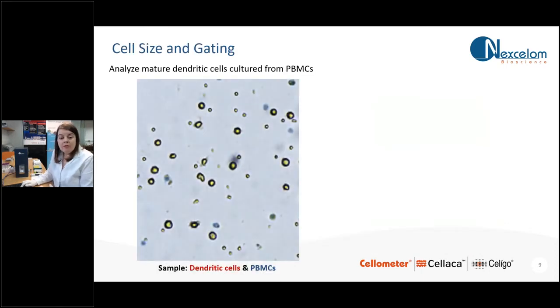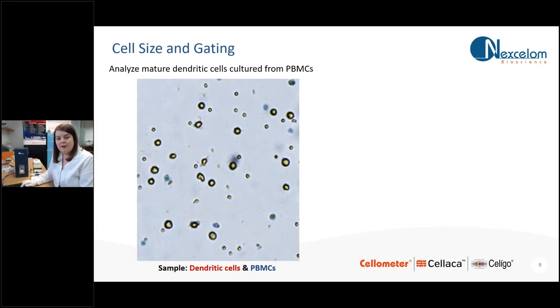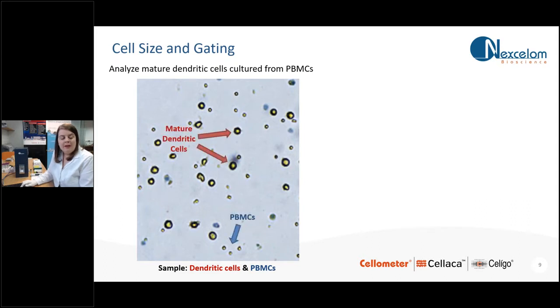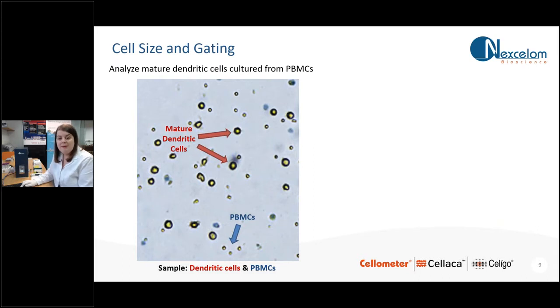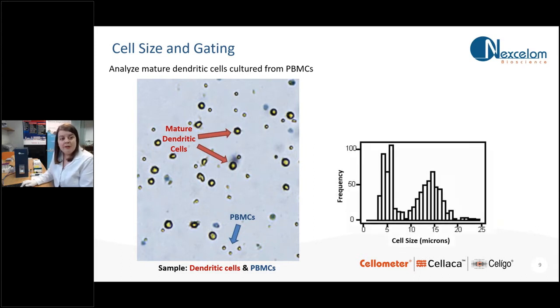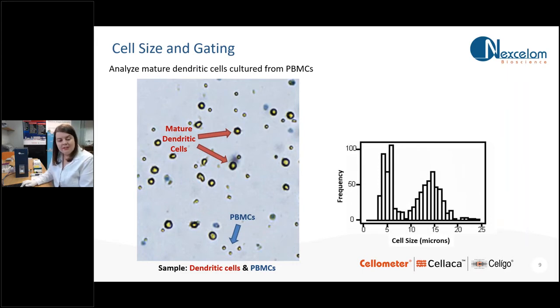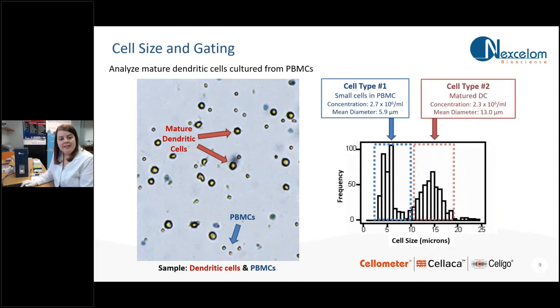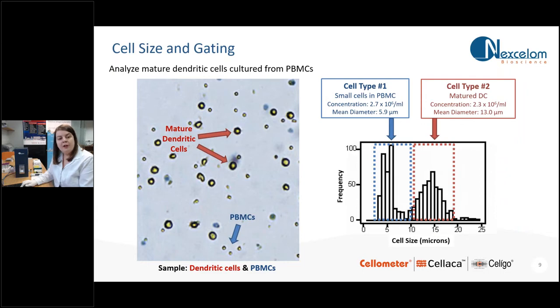So that algorithm also means you can accurately determine the cell size within your population as well. Therefore, when you have a mixed population, you can add a size gating to determine the number of cells within each population. So here we have a mixed population of mature dendritic cells and some smaller PBMCs. There's a distinct size difference between those two cell types. You will get your histogram within your results to show you your size distribution of your cells. And when there's a distinct difference like this, you could use the gating software to determine the total number of PBMCs and the total number of the larger dendritic cells as well.